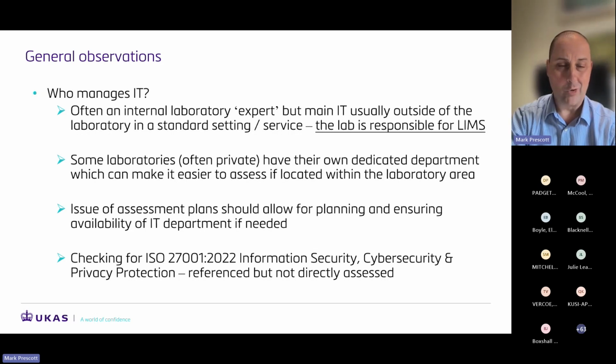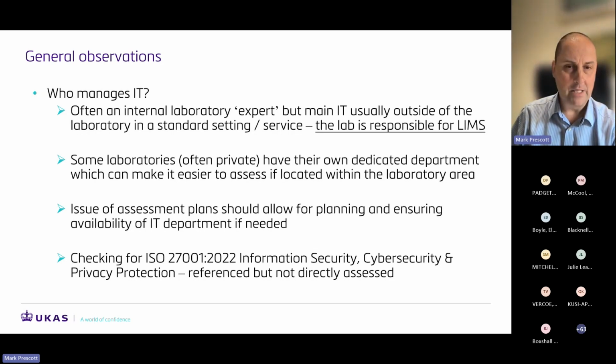That doesn't mean that we don't need to assess against 15189, but if I go into a laboratory and I know that laboratory has got this certification, then I can be fairly assured that in terms of the security aspects of it, it's fit for purpose. So do check with your IT departments to see if they have this, because it can be very helpful, and have the information available to the assessors, and perhaps even their last report if you've got that.